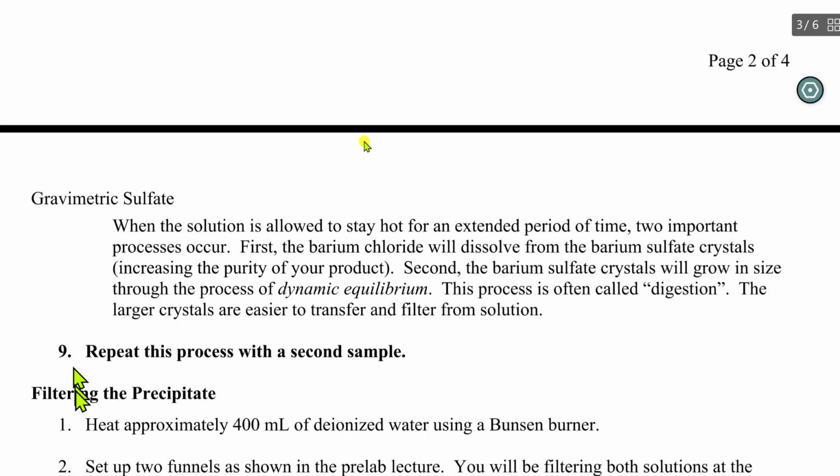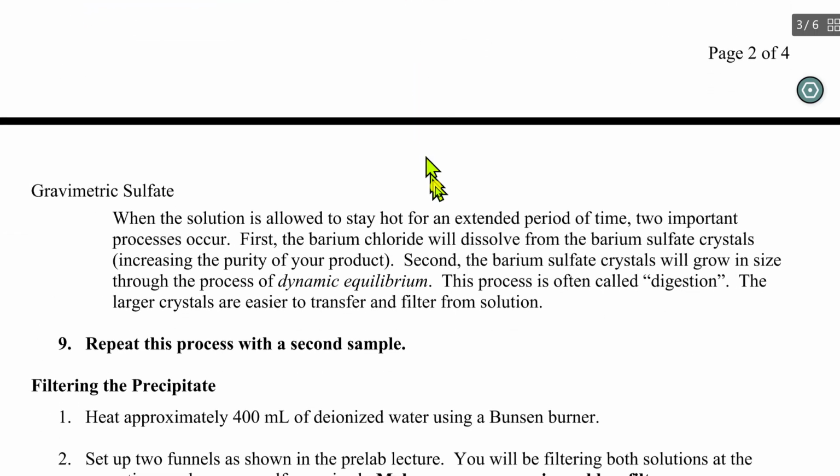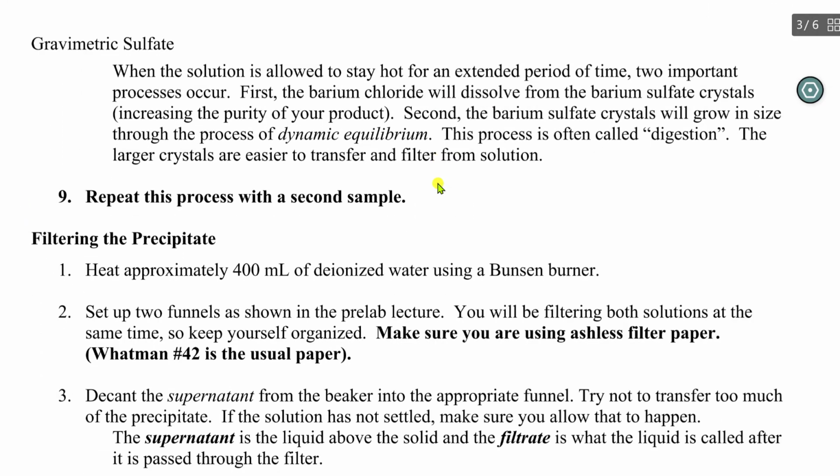So make sure you cover this with a watch glass, because that slows the cooling rate and allows that digestion process to take place over a longer period of time.